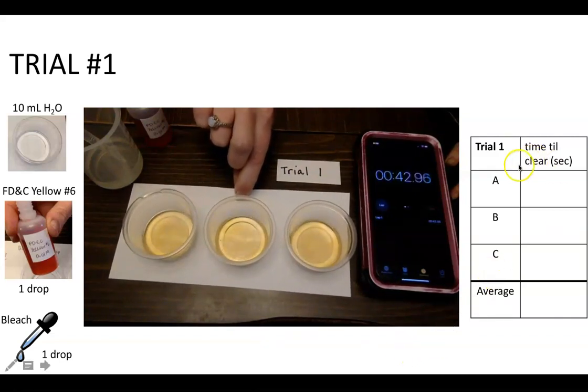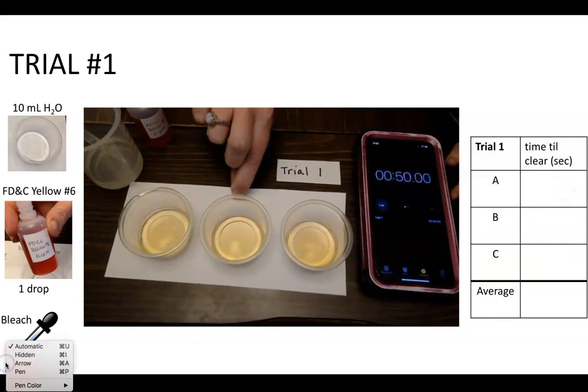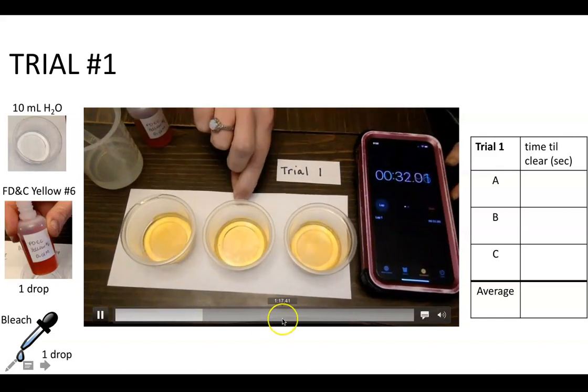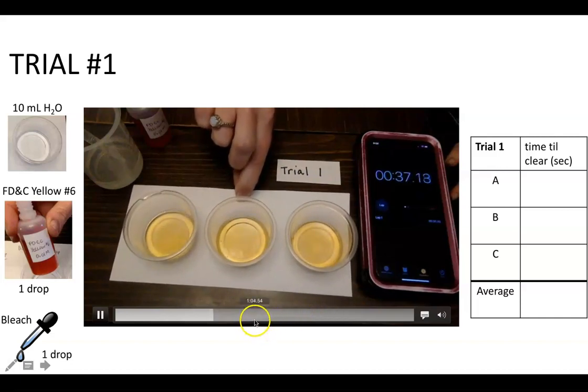So I have just a fraction of the table here. So you would record, and I can show you what I'm talking about. Oh no. How do I get it to play? Oops. So maybe I can't write at the same time. Boo. Okay, well then I'll just narrate it. So where were we? We were like 30 seconds in. Trial 1. Okay, so keeping an eye out here.